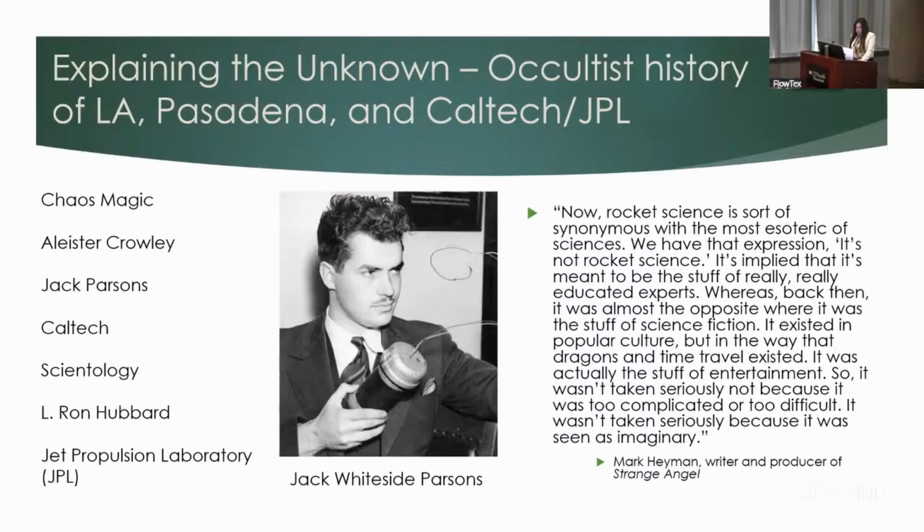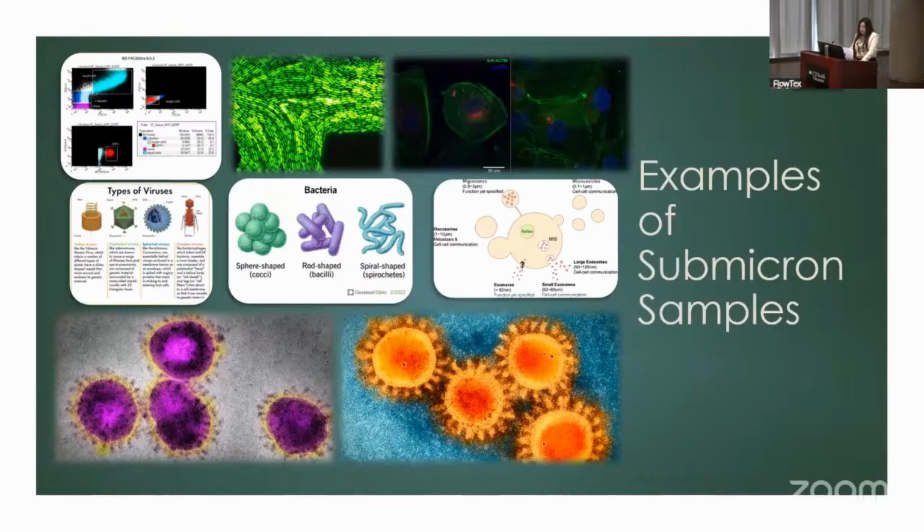All right, so now that we've covered some locational context for where the research was done, I'll continue with broad examples of a few types of submicron samples that you may encounter, or maybe not, I don't know. Plus a dot plot from one of the actual submicron sorts I did. It was actually the last sort I ever did before I left.